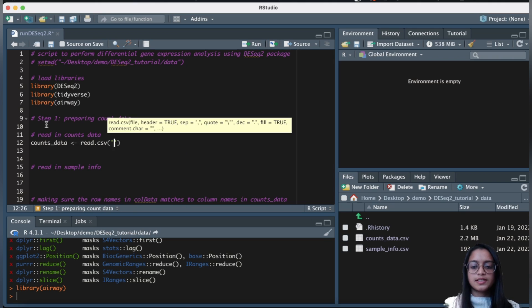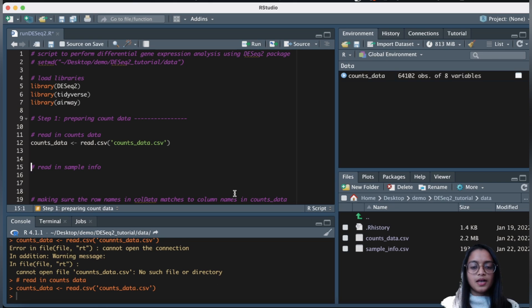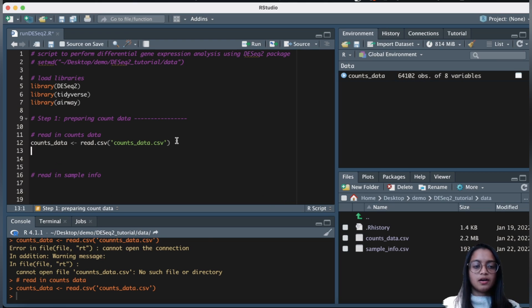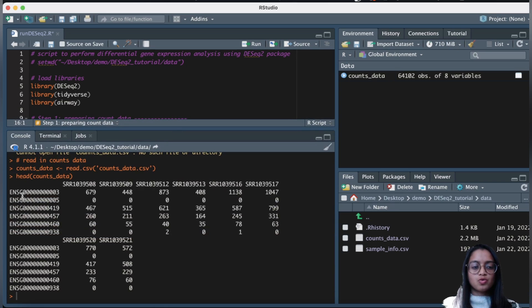I'll be reading in the CSV files. We can see that the counts data has over 64,000 rows and eight columns. Taking a look at our counts data, we can see that the rows are gene IDs — these are Ensembl gene IDs — and the columns are the sample names.